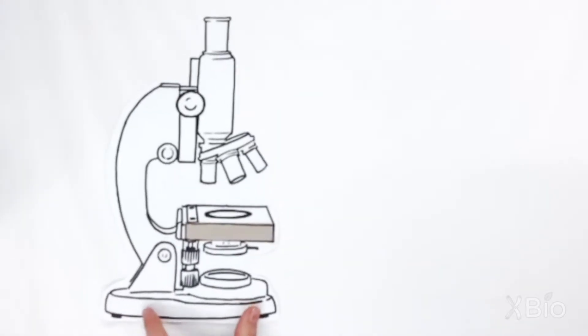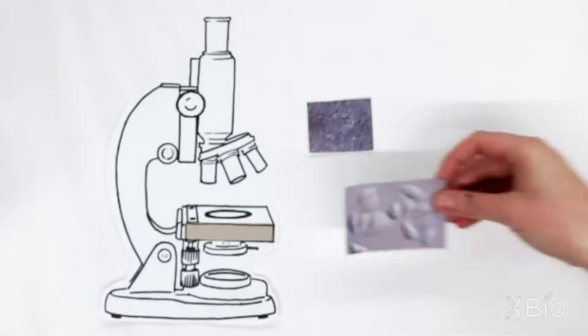Microscopes are an essential tool for biologists to see the tiny things they study. But no matter how much you zoom in with a microscope, some things are just really hard to see.